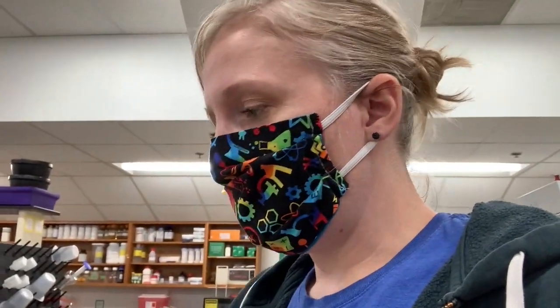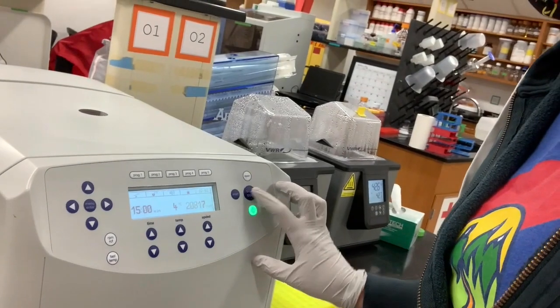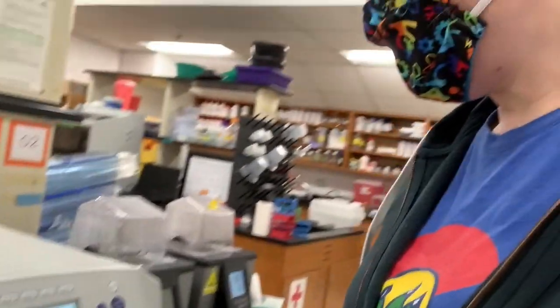If you have forgotten to cool down the centrifuge, you can cool it down and leave your samples in the freezer until it's cooled down. And then you're going to hit start. And then this spin will last for 15 minutes. At the end of that spin, I'll be back and we'll talk about the second spin.